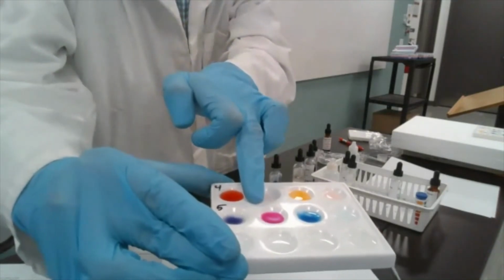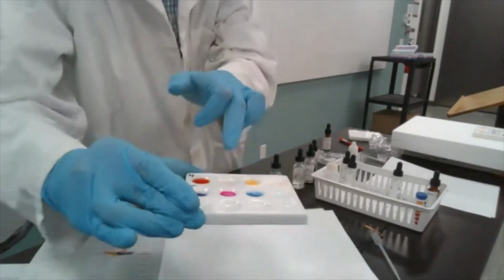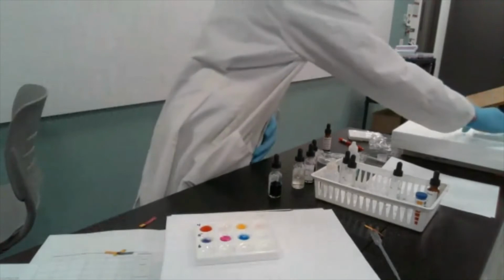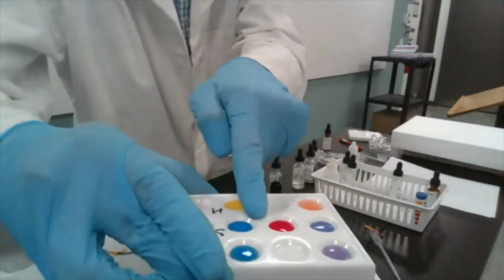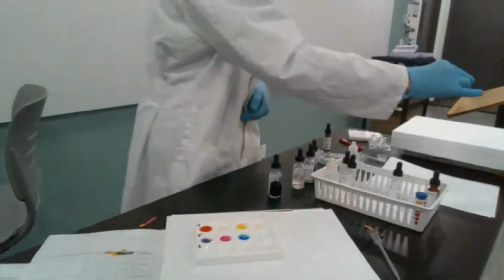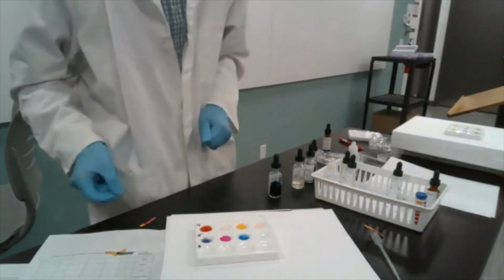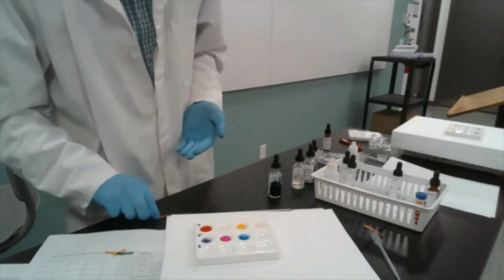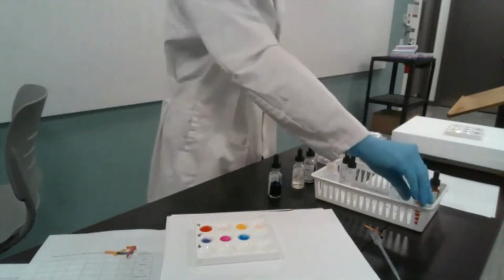And we have a lighter pink with phenolphthalein compared to what we had with sodium hydroxide, if you remember. You see that with sodium hydroxide, that pink was so deep that it was almost blood red. So what does it tell us about the chemical nature? Well, you be the judge and fill out your conclusion accordingly.